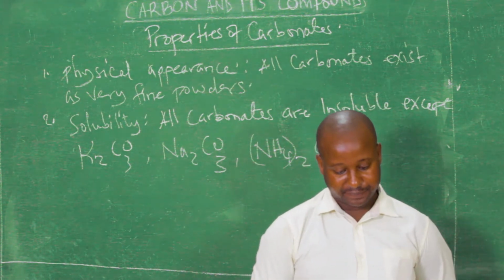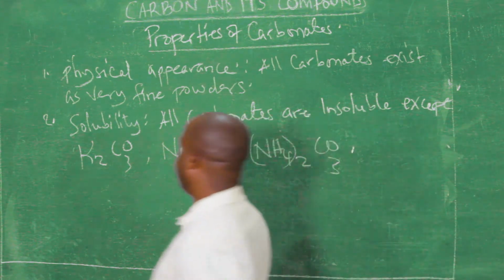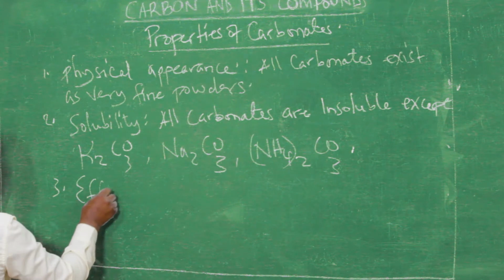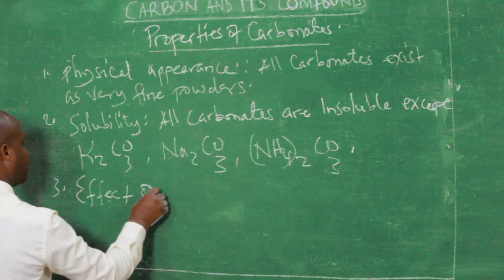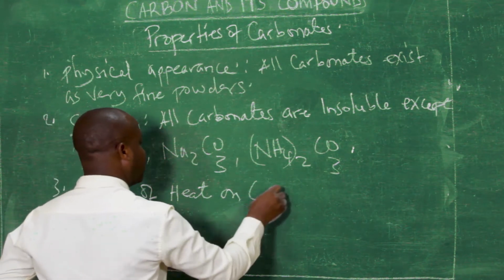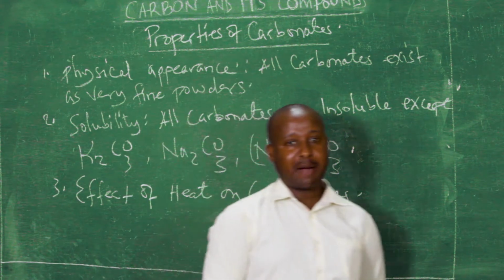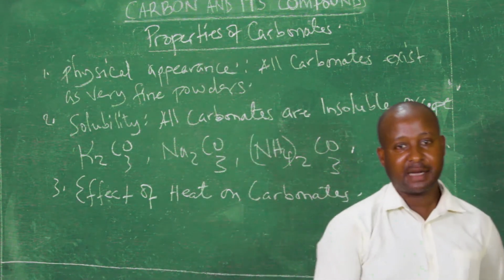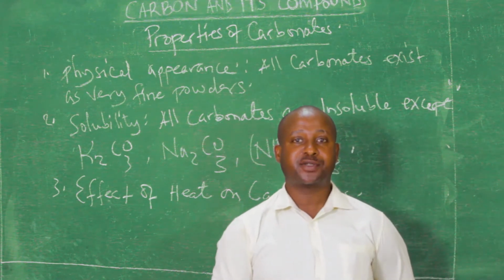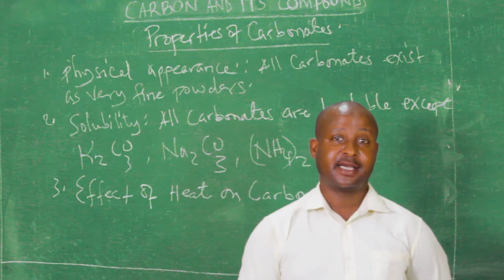Let's look at the effect of heat on carbonates. Something very interesting and so important for us to discover is how heat affects carbonates.